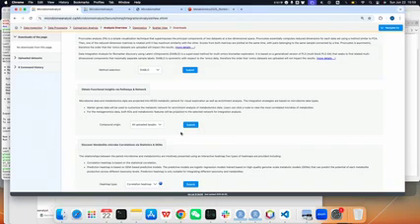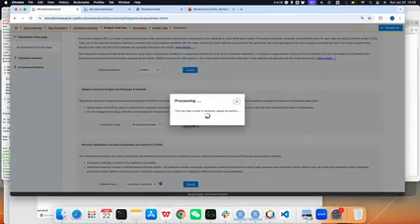Basically, because the sample we uploaded is the stool sample, both metabolomics and microbiome are from the stool sample. So we think the metabolites mostly come from the microbes. So we can see if the peaks are enriched in the metabolism of specific microbes. For example, we can either use all the taxa we have uploaded or the significant taxa. So we just try what we have uploaded.